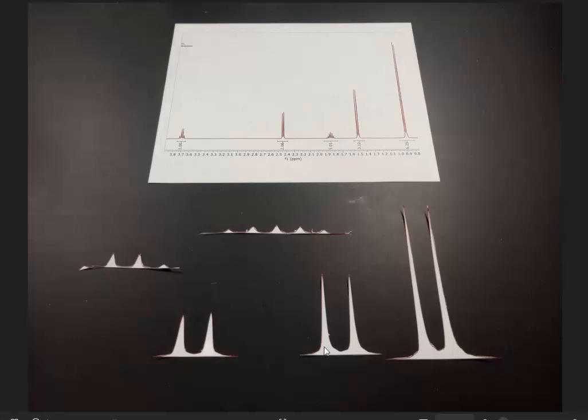If you want to compare integrals, ideally they have the same peak shape, because peaks with different peak shape will include various amounts of the baseline into the integration, both for better and for worse, depending on whether the baseline is deviating high or deviating low in that area. The message is that you can be much more precise with your integrals in a case where you are comparing peak shapes that are identical, but as soon as you start comparing peak shapes that are different from each other, what you'll find is greater deviations than you might expect.